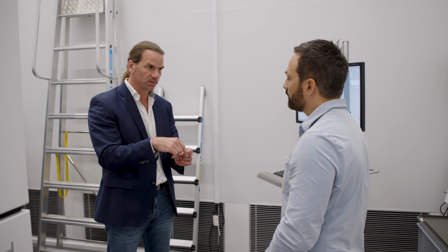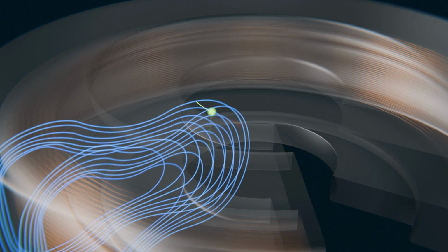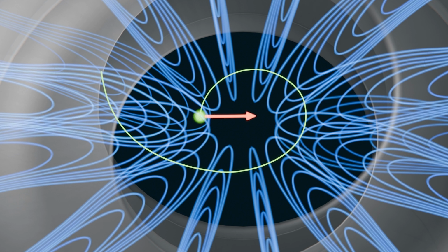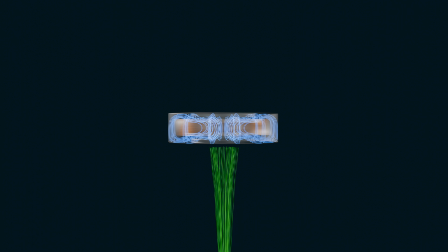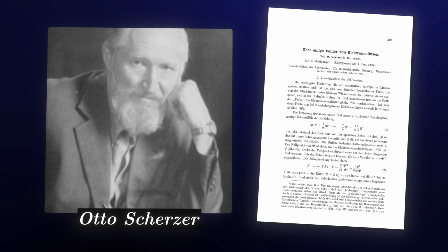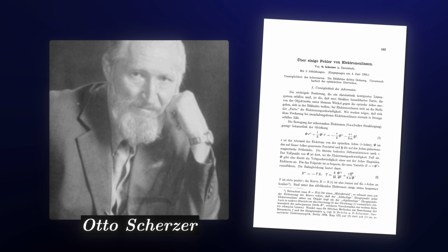So the electrons will always cross through two lines. The first time it passes through by the Lorentz force, it's brought into the spiraling motion, and then the second time, from that spiraling motion, which has then a slightly different direction, it's pushed towards the axis. That's why all electromagnetic lenses, by default, will converge the beam and never diverge it. Even if you shot electrons in from the other side of the lens, they would still get focused. This is what Otto Scherzer's paper proved in 1936, stopping progress on the TEM. It is impossible to produce a radially symmetric magnetic lens that diverges.